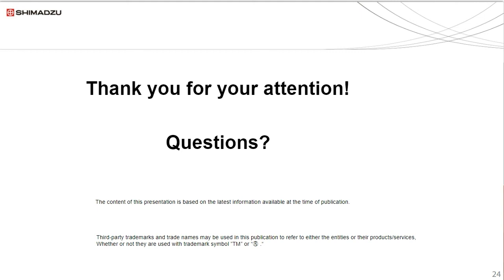That said, again, the limitation is ppm level detection limits are common on the XRF, whereas you can get parts per trillion with ICP-MS. Good. So the next question is about cones. What kind of sampling cones and skimmer cones does Shimadzu provide, and what kind of cones would you recommend for pharmaceutical?